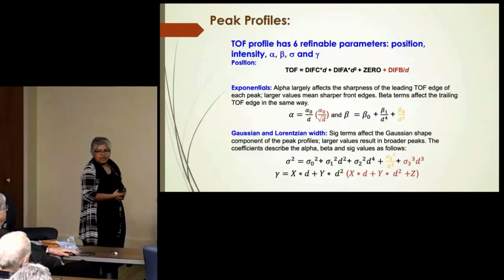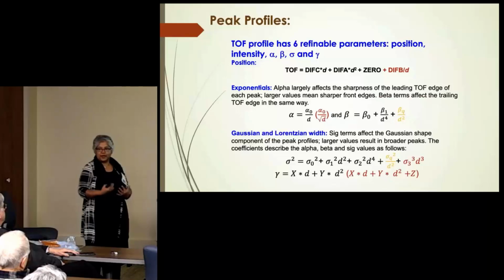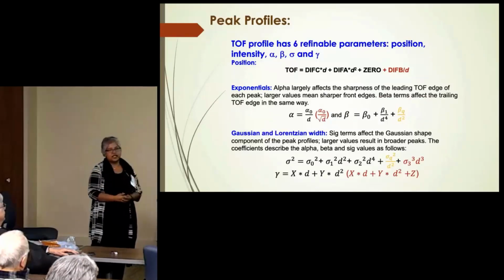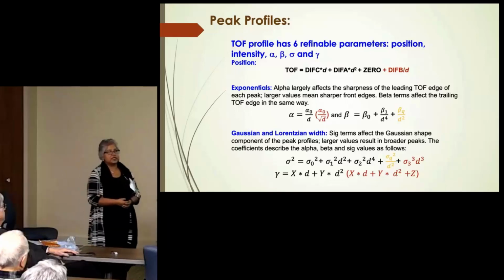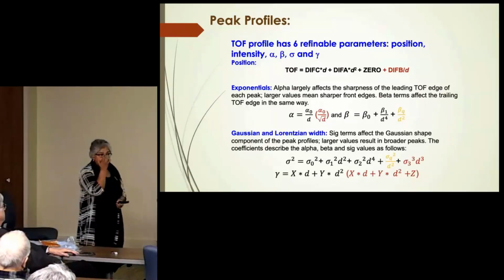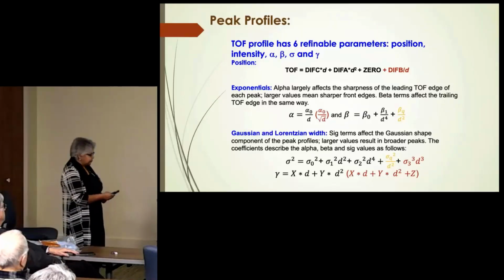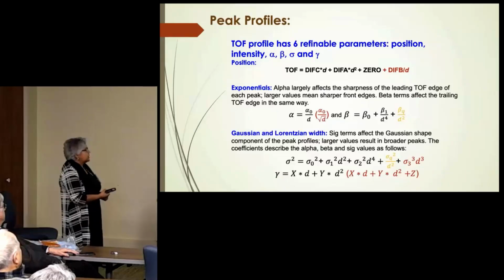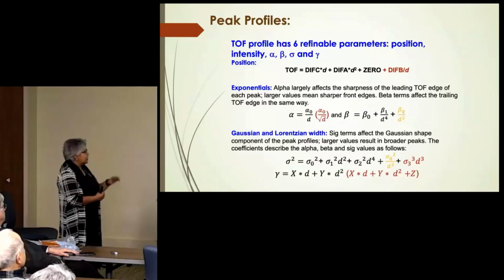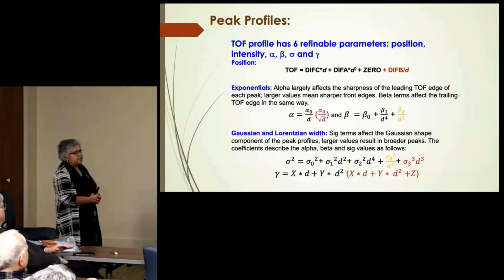So I did a lot of peak fitting. Bob did a lot of peak fitting. And then we eventually said, okay, we still use the same profile function because it still holds, because we are on a coupled moderator. But we add a couple of terms. So this was Bob and I working on the POWGEN peak shape, and we ended up adding some additional terms.